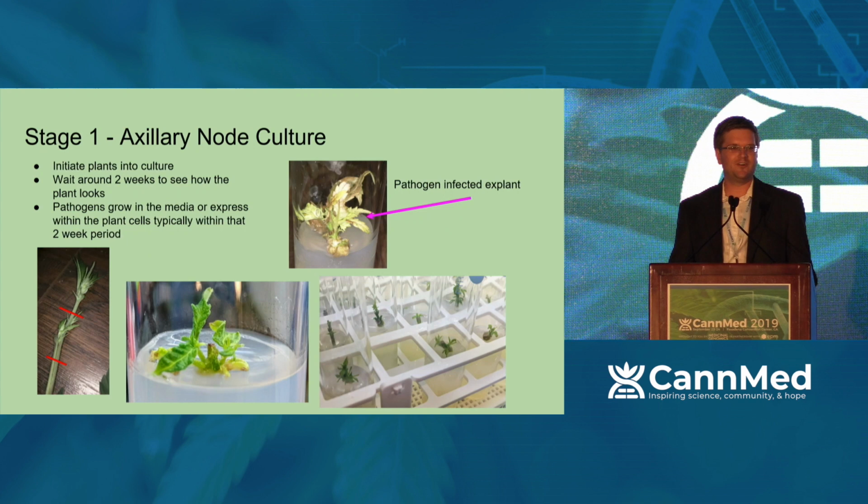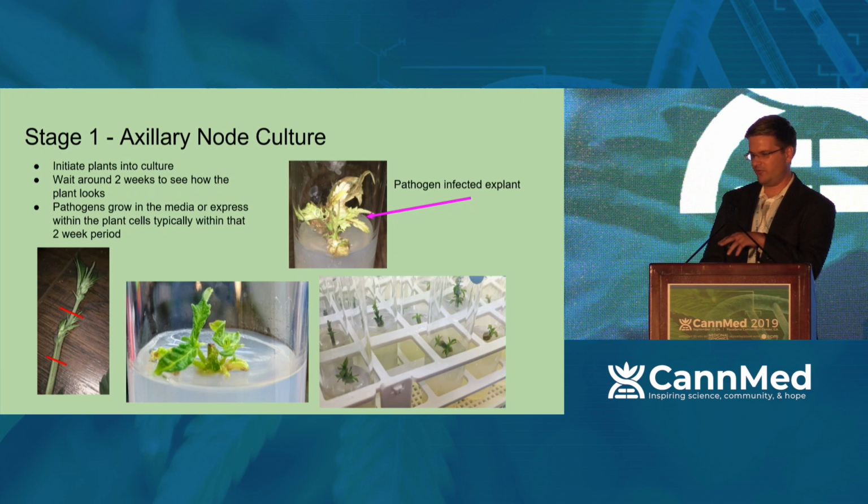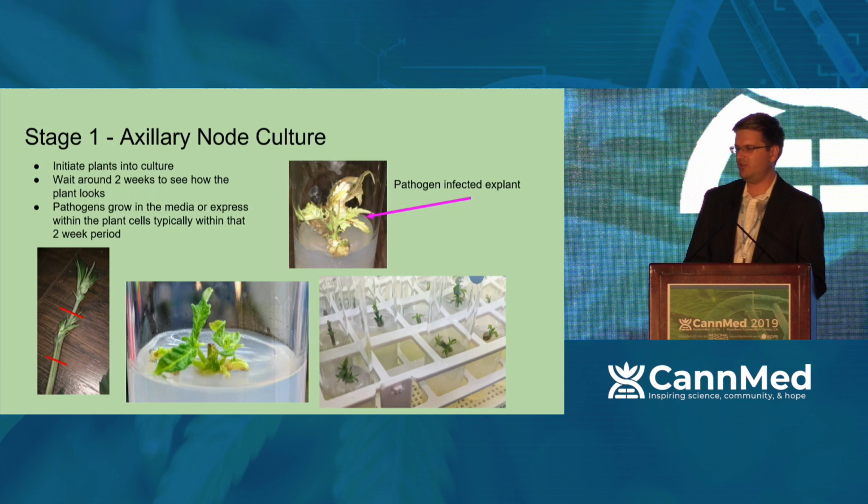So with axillary node culture, all you do is you take a cutting where those red lines are, and you can just stick it straight in your media after cleaning the exterior tissue. Generally, this works out. So that second picture in there, you can actually see shoots starting to form out of the plant, and that's actually two plants out of one. That took about a week to get to that stage, another week of growth, and it would have been good enough to cut off of, making it so you can exponentially multiply your cuttings.